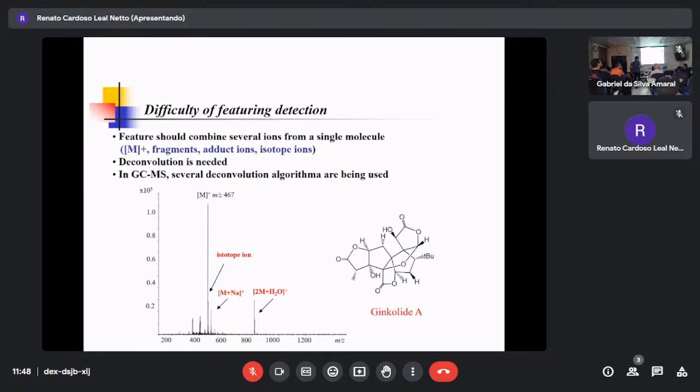The problem is that mass spectrometry is very sensitive. This one is very quantitative, but sometimes this one is not quantitative because it's mass. Then there are two ways. First, decide which mass signals are fragmented ions from one molecule. Then among those, I select only one fragmented ion which is quantitative, or I can sum them up. That is featuring. Featuring means, simply speaking, which mass signal is the representative of the molecule. That's the signal.